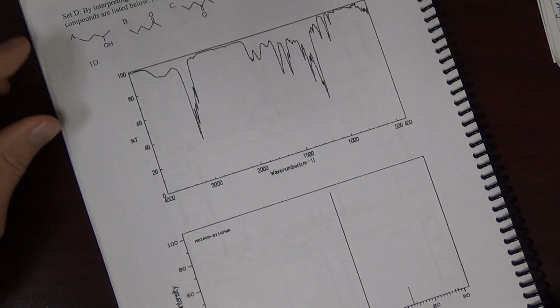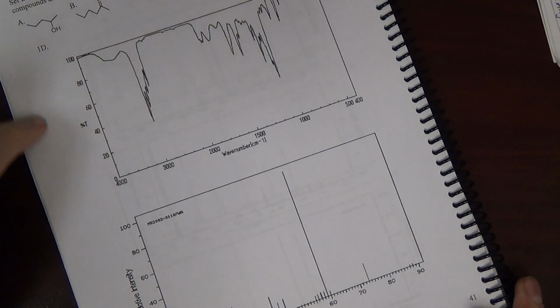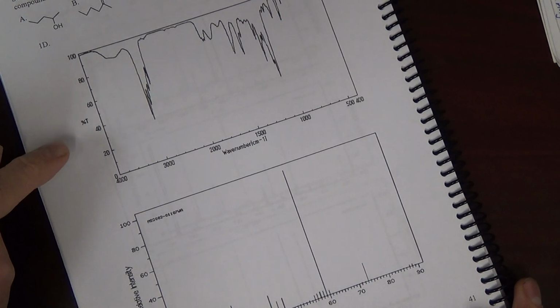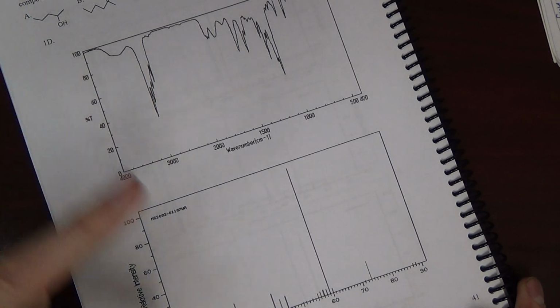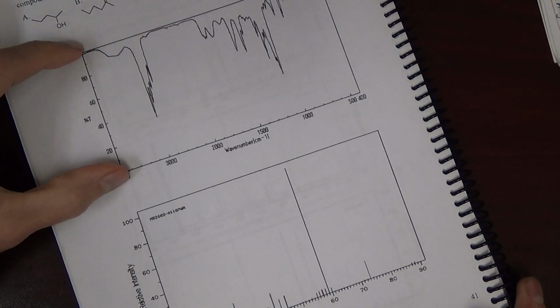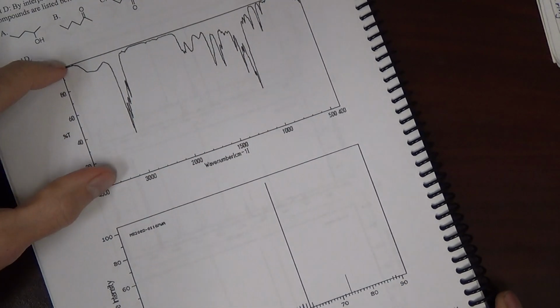And on these, page 41, it's just one compound. Which compound belongs to these two spectra? I'm providing an IR of the compound and a mass spec of the compound. So these can be complementary. It also gives you a chance to review and remember your IR. And we can make use of this.